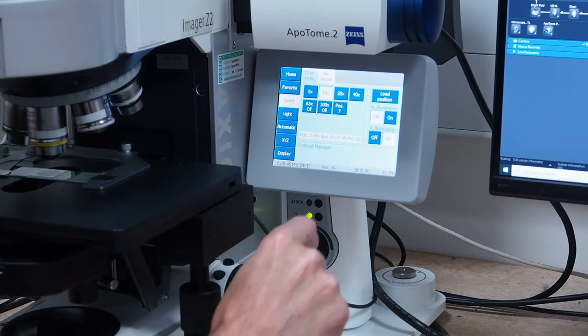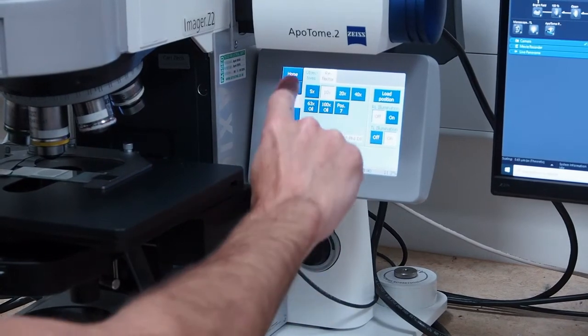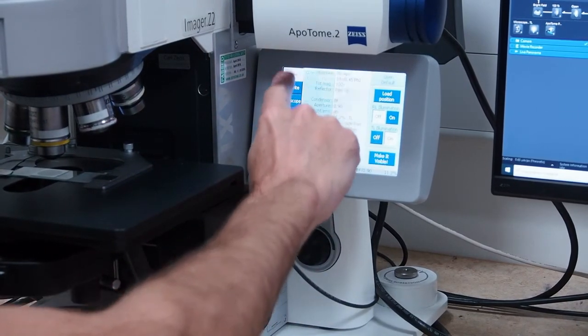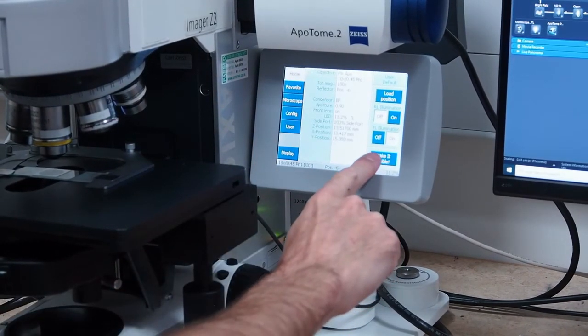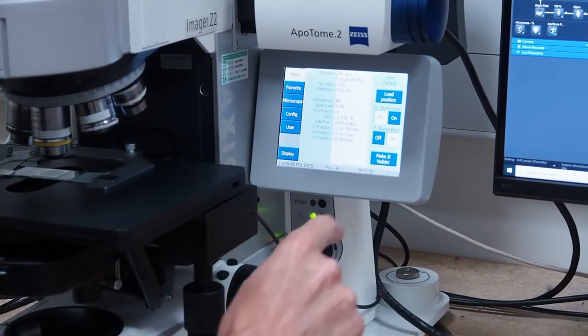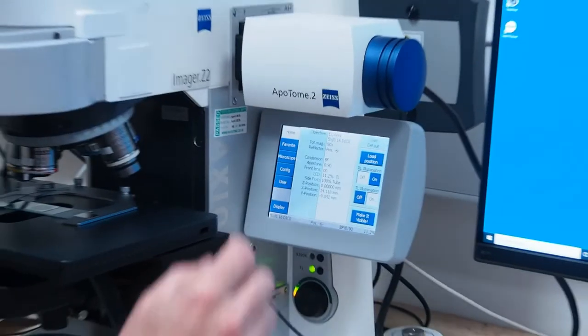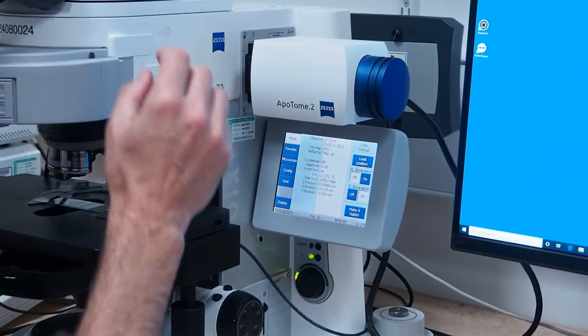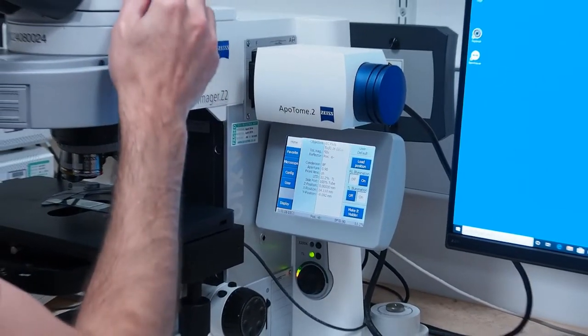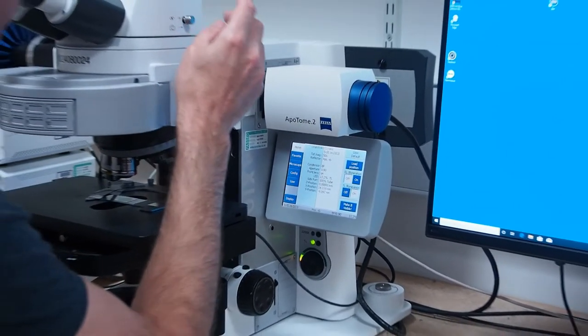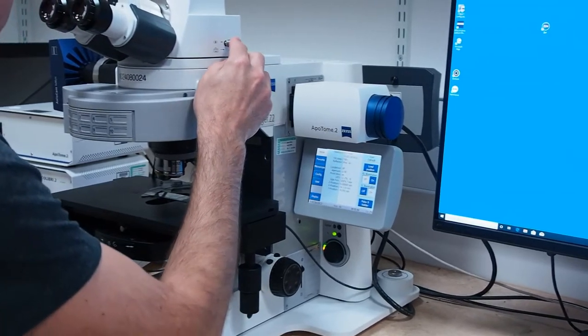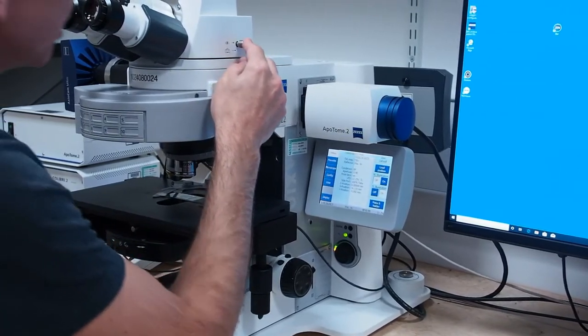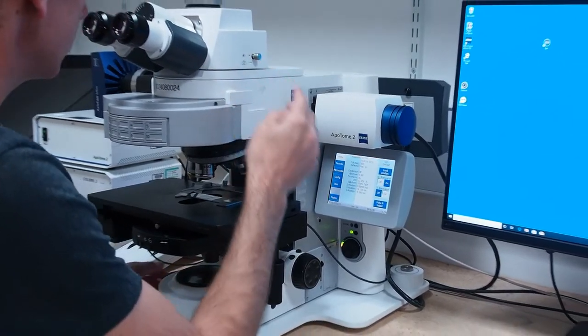Next, click the home tab and then the make it visible button on the lower right of the screen to switch the bright field lamp on and move the light path to the oculus. There is a slider on the side of the microscope that should be pushed in when viewing through the eyepieces and pulled out when using the camera.